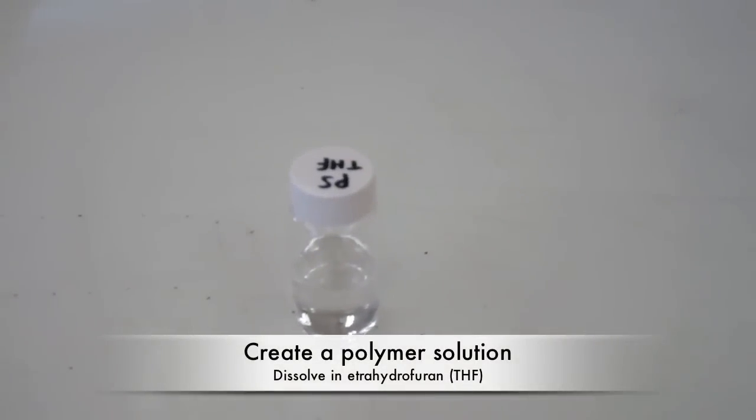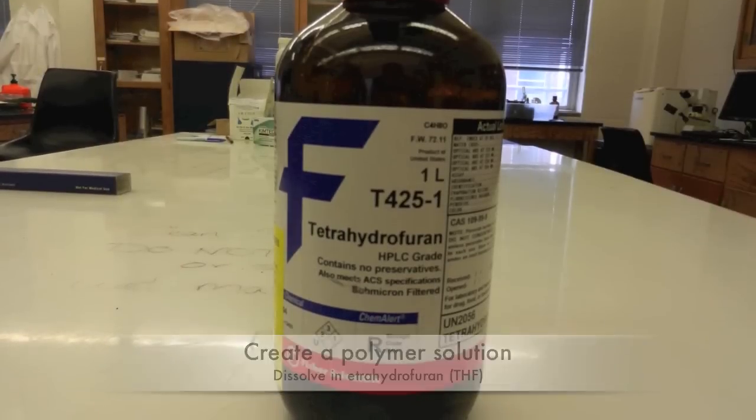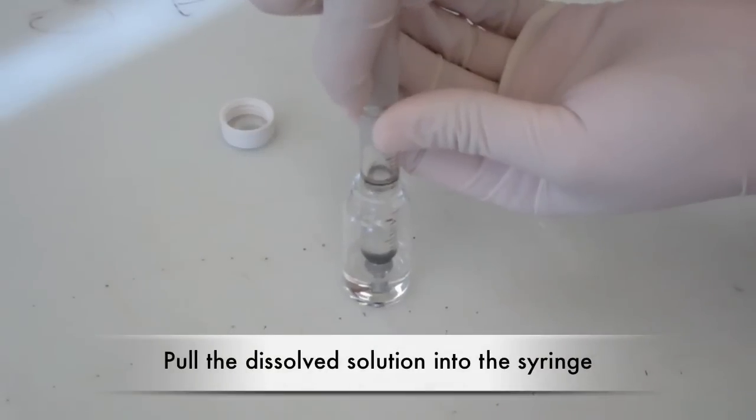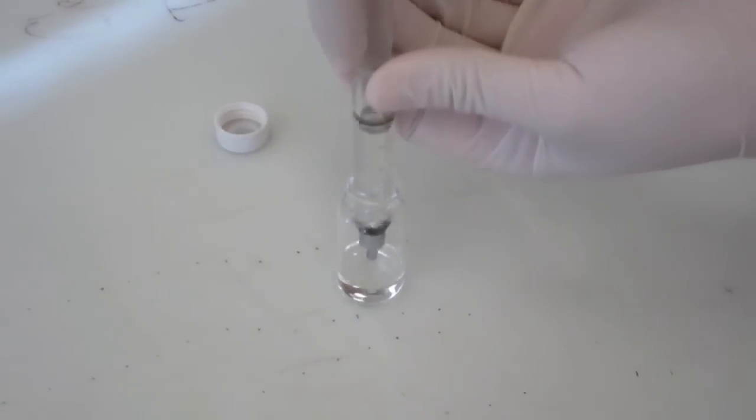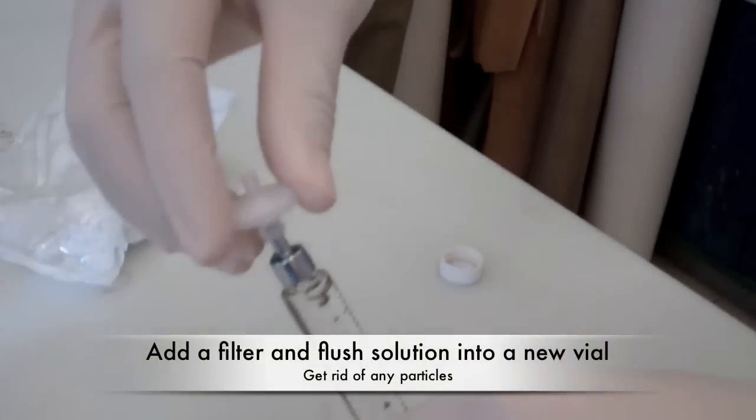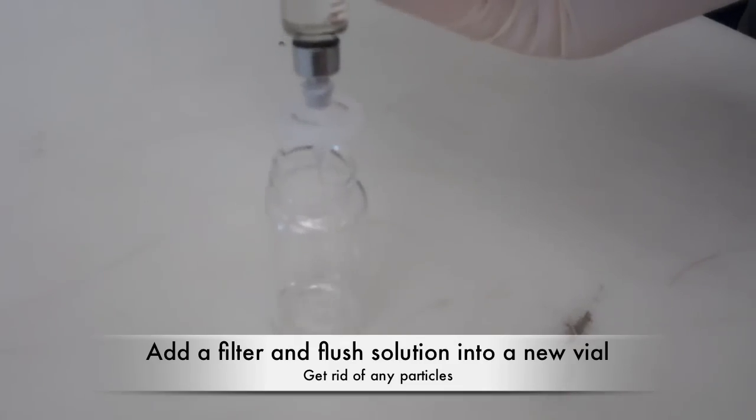To analyze your polymer sample, first dissolve the polymer with THF. Once dissolved, pull the solution into a syringe, then filter the solution to get rid of any particles that may clog the columns.